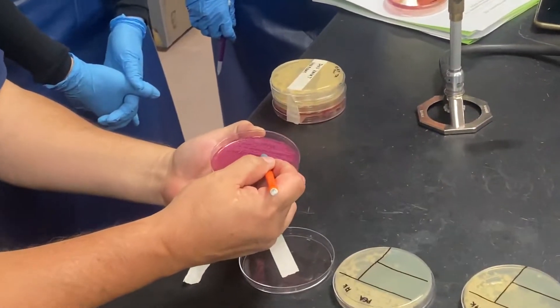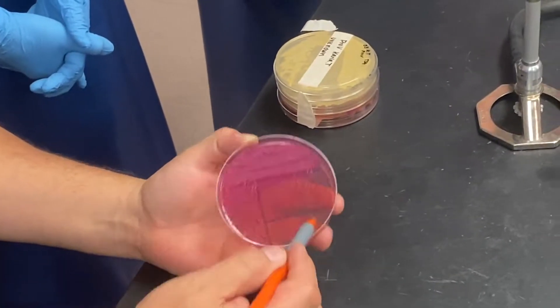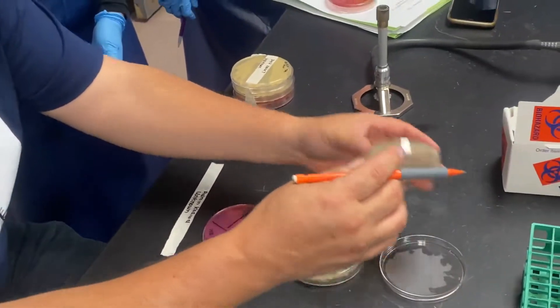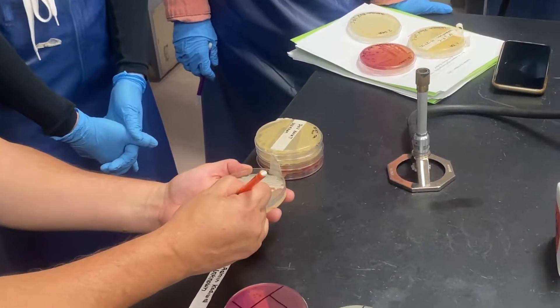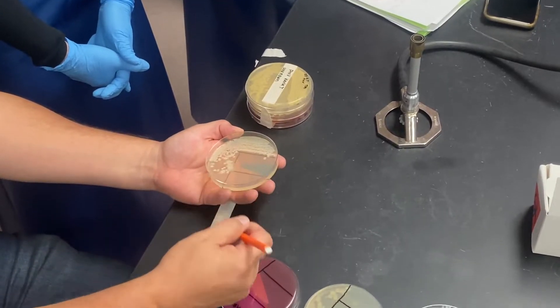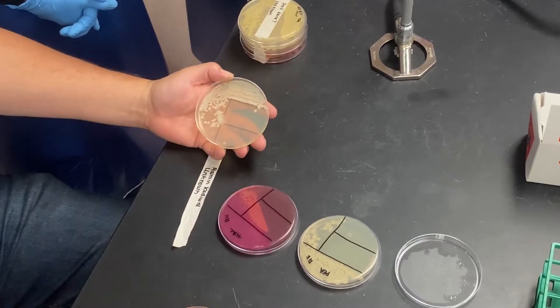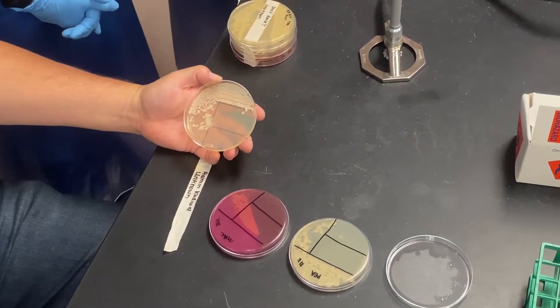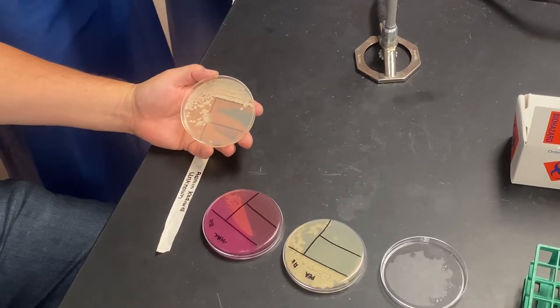So if we look at the morphology here, we notice that the colony is a type of a medium sized colony. So if we go back to the TSA plate and we look, there's a big old gigantic colony and there's a little bitty medium sized organism. Which one do you think is gram negative? The big old gigantic dude or the medium sized dude? This is how you think about this. What was the answer? The medium sized looking thing.